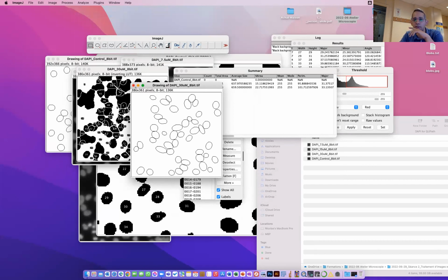So yes, this can be a challenge, and that's what I wanted you to know: for some images, these kinds of things work very well. For some other images, they don't work well at all. But fortunately enough, there is good news.